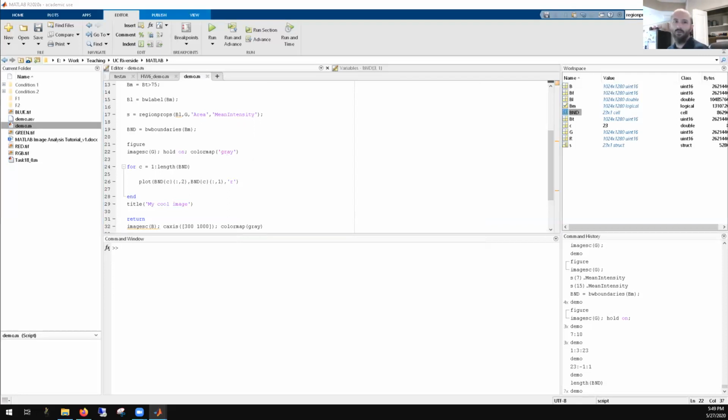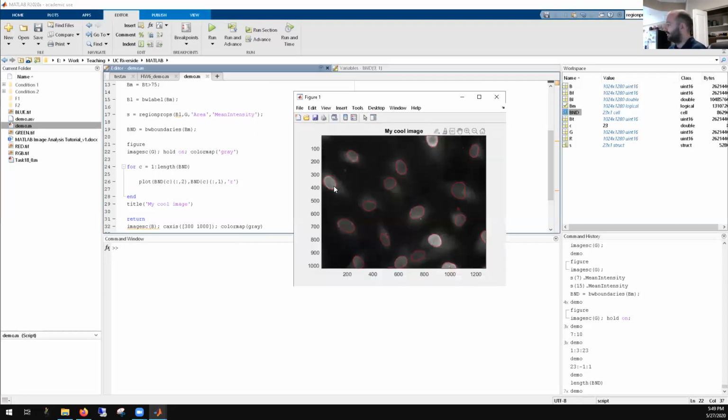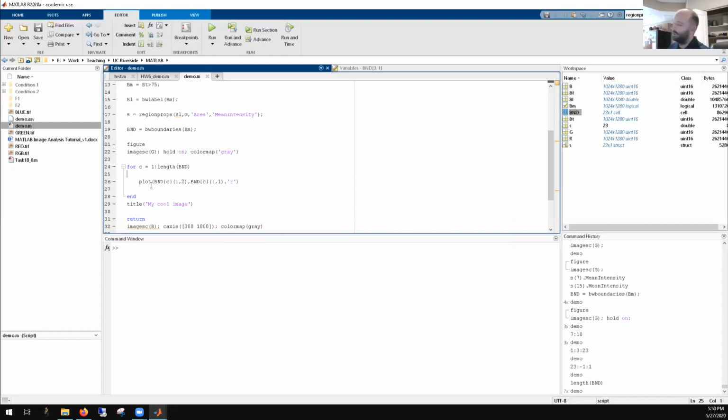And the reason why it's always going to be grayscale is because it reinforces that this was a monochrome image, and all of the immunofluorescent images we take are monochrome. Even if the cells are fluorescent green, our camera is monochrome. So grayscale reinforces that we were acquiring a monochrome image. And then also you get that linear intensity shift, which means a linear correlation between intensity and brightness. So you end up with a very good perception of what's going on in the image. But that was a good question, thank you.